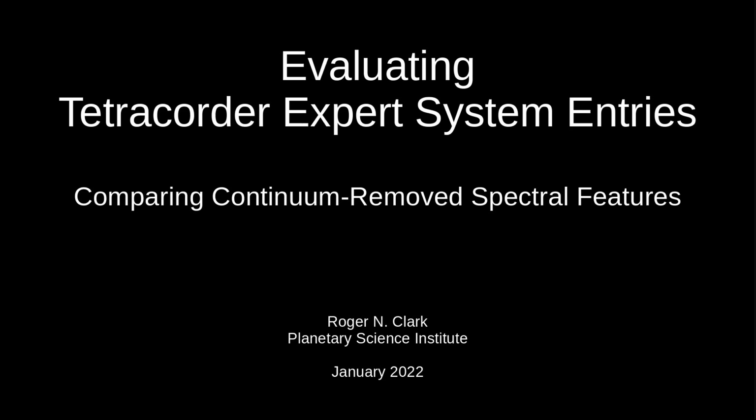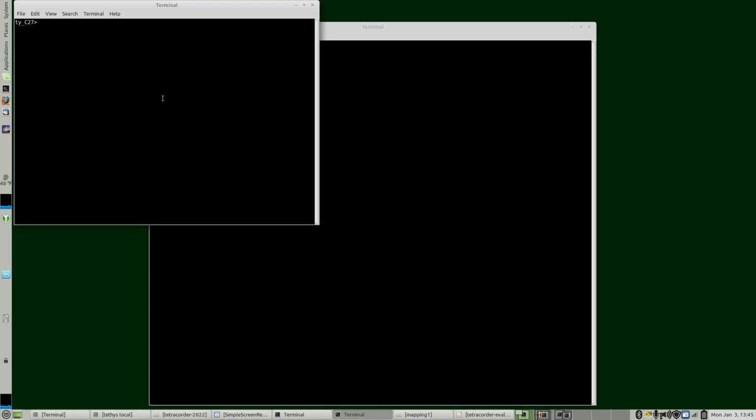In this session, we're going to evaluate entries in the expert system of Tetracorder and compare the continuum removed spectra and the continuum endpoints that define spectral features. I have two windows open, and we'll see where I've placed the location.